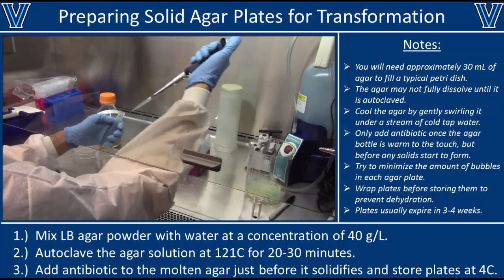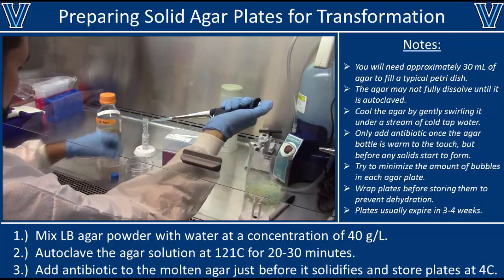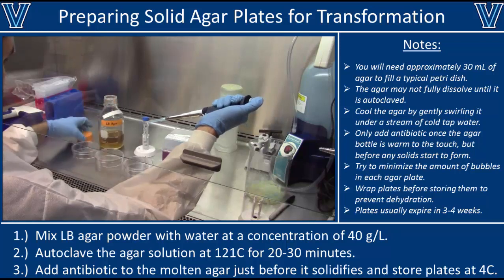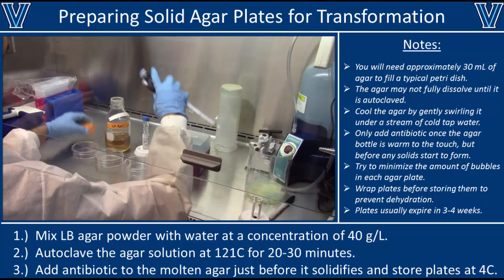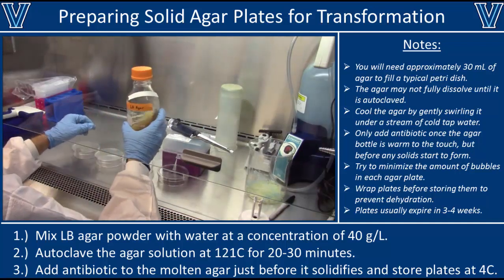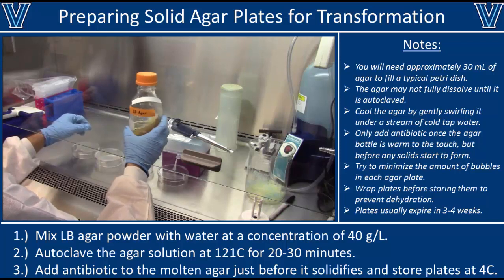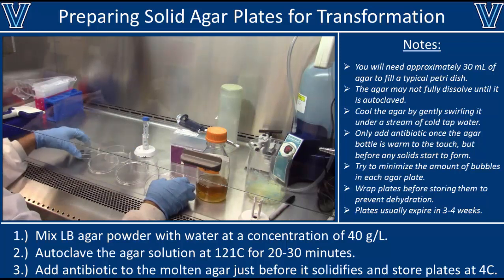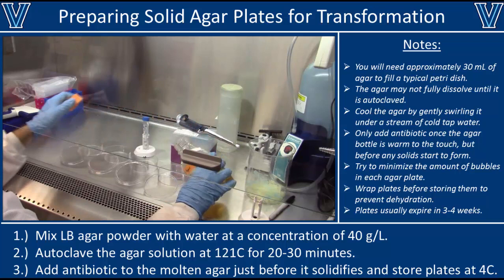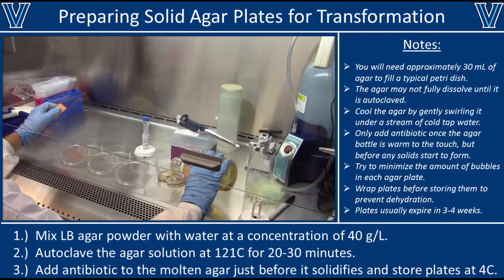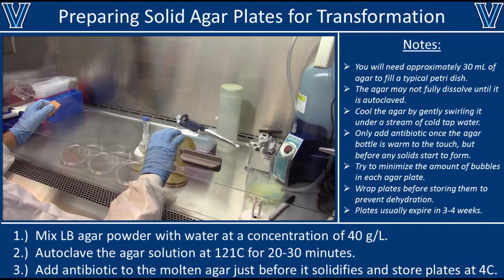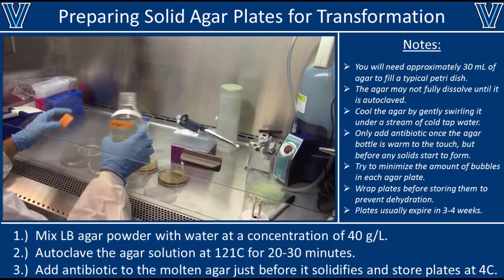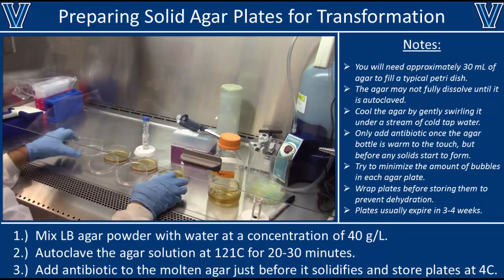Once your agar is cooled, it's time to make your plates. Add antibiotic to the LB agar — in this example I'm adding 200 microliters of 100 meg per ml ampicillin to 200 ml of LB agar. If you're working with a different antibiotic, you may use a different stock concentration or volume. Once the antibiotic is added, give it a good shake to mix, but try not to create any bubbles. Pour your plates — typically each plate takes around 30 to 40 ml, about a quarter inch of LB agar, roughly 30 to 50 percent full.